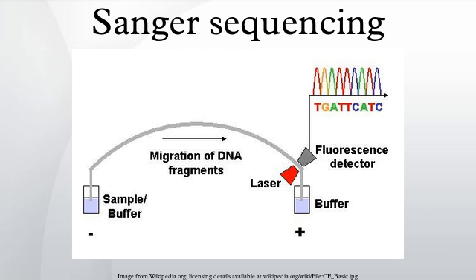The capture gel through which the sample is driven consists of 40 µM of oligonucleotide covalently bound to a polyacrylamide matrix. Extension fragments are immobilized by the gel matrix, and excess primer, template, free nucleotides, and salts are eluted through the capture waste port. The capture gel is heated to 67-75 degrees Celsius to release extension fragments. Capillary electrophoresis. Extension fragments are injected into the CE chamber where they are electrophoresed through a 125-167 volt per centimeter field.